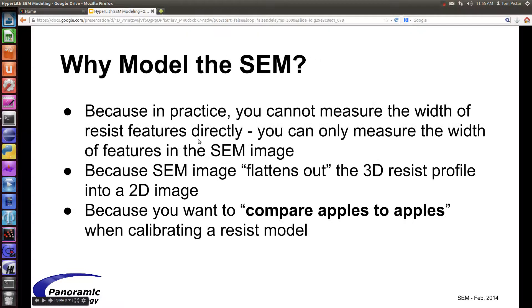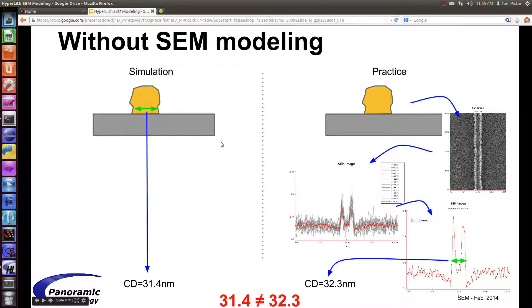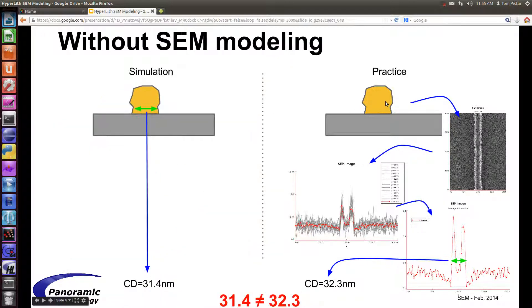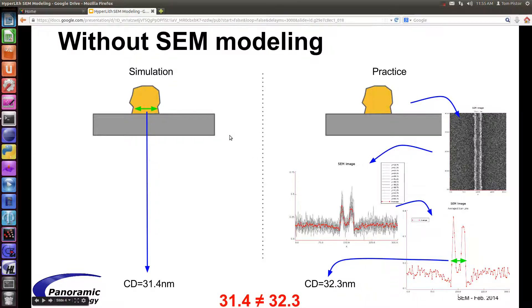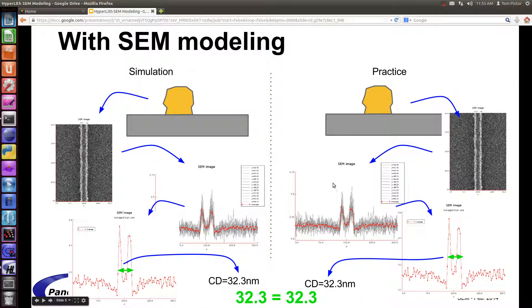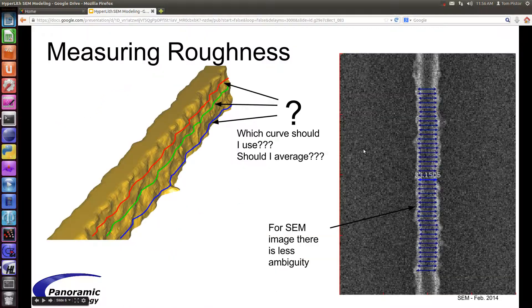The new SEM simulator at Panoramic allows you to simulate SEM images, and you want to do this because in practice you can measure only a SEM image. You can't directly measure the resist profile. Instead you make a SEM image and you measure that. With SEM simulation now you can do apples-to-apples comparisons. You can take a simulated resist feature, produce a SEM image, and then measure this SEM image in the same way that you measure the experimental SEM image using our SEM image analyzer.